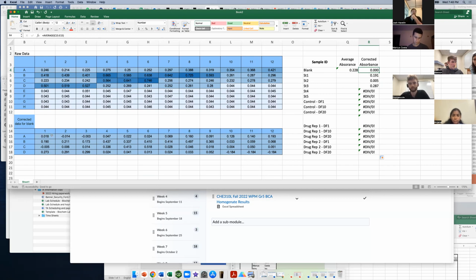Whereas before I did this equals thing and linked those cell IDs and dragged it over and down, it mapped back to each of these cells. What I did over here was, again, equal, average, these three cells, right? Does everyone still see that? Who can guess what this cell is going to equal? This one right below the original. Is it also going to be 0? Nope. So what cell IDs is this going to be linked to? B? Like group B, the one below it?